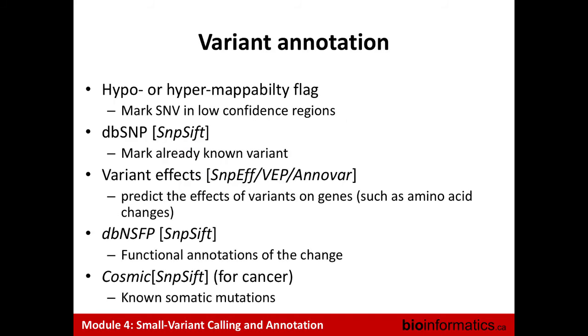When you have filtered your variants using the different approaches, what you want to do is an annotation of your data. What we often use is the mappability flag. We use our own mappability track that we developed, but there are some mappability tracks available from Ensembl and other consortia. The idea is to flag regions of the genome where you know there's a mappability issue. Either there could be lower reads, so it's more difficult to map in this region, or an excess of reads, so a lot of repeats could arrive in this region, and probably they will be false positives. So it just tells you to tag some variants to say, okay, this variant is in a region I'm not really trusting, so I won't put all my money on that variant.